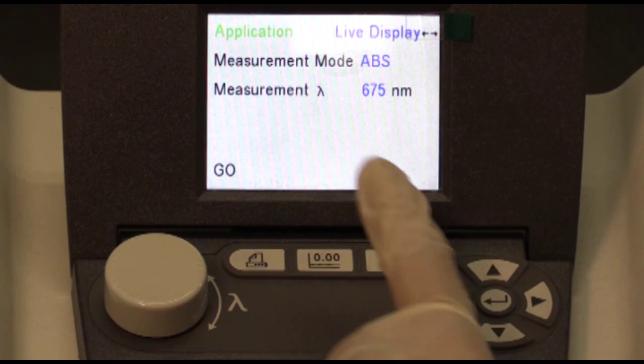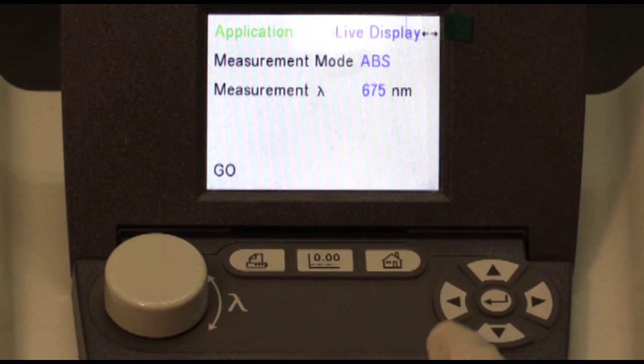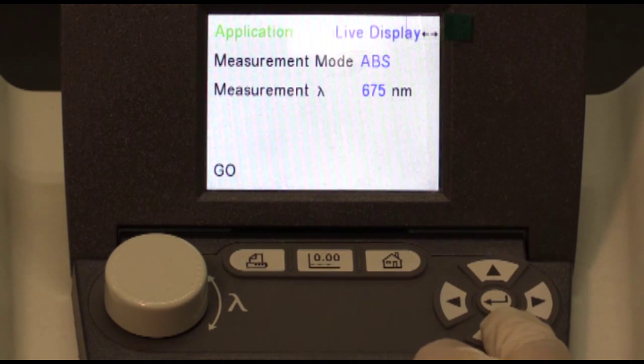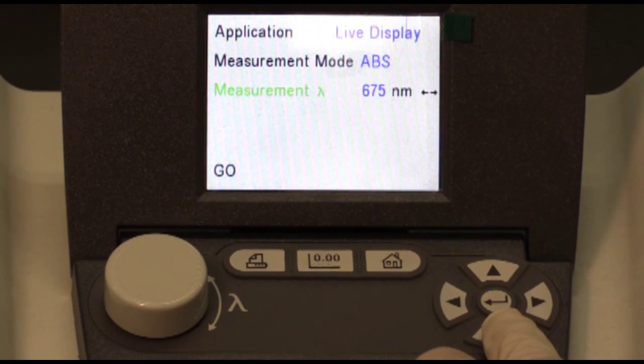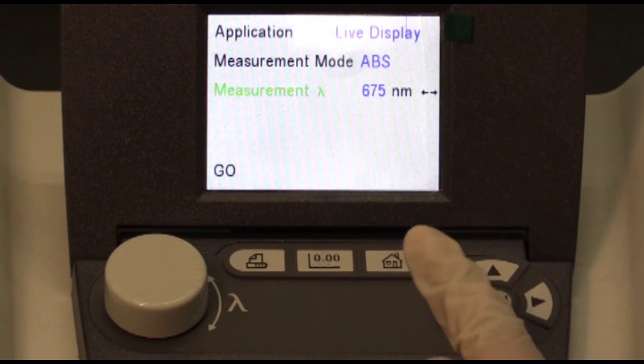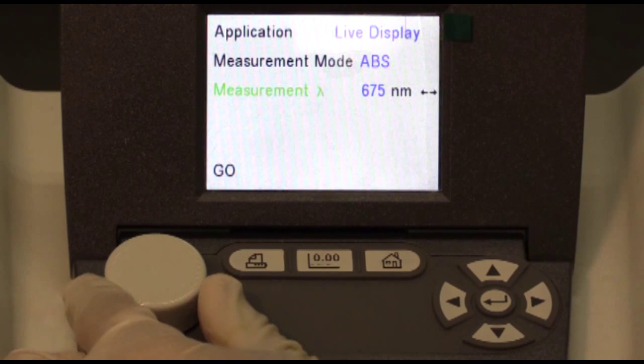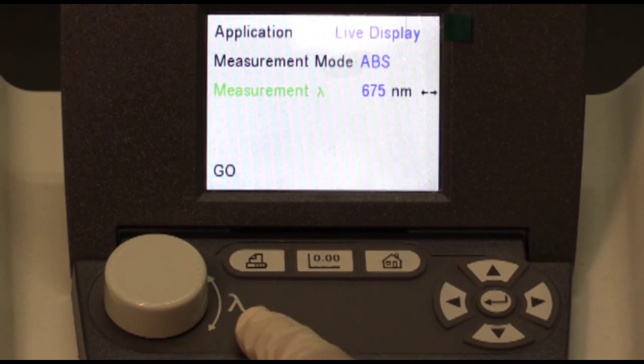Now scroll down and highlight the measurement lambda option. Once it's highlighted, this is where you can adjust the wavelength, and you do that using this dial with the lambda marking on it. For this particular application, we'll be using a wavelength of 686 nanometers.